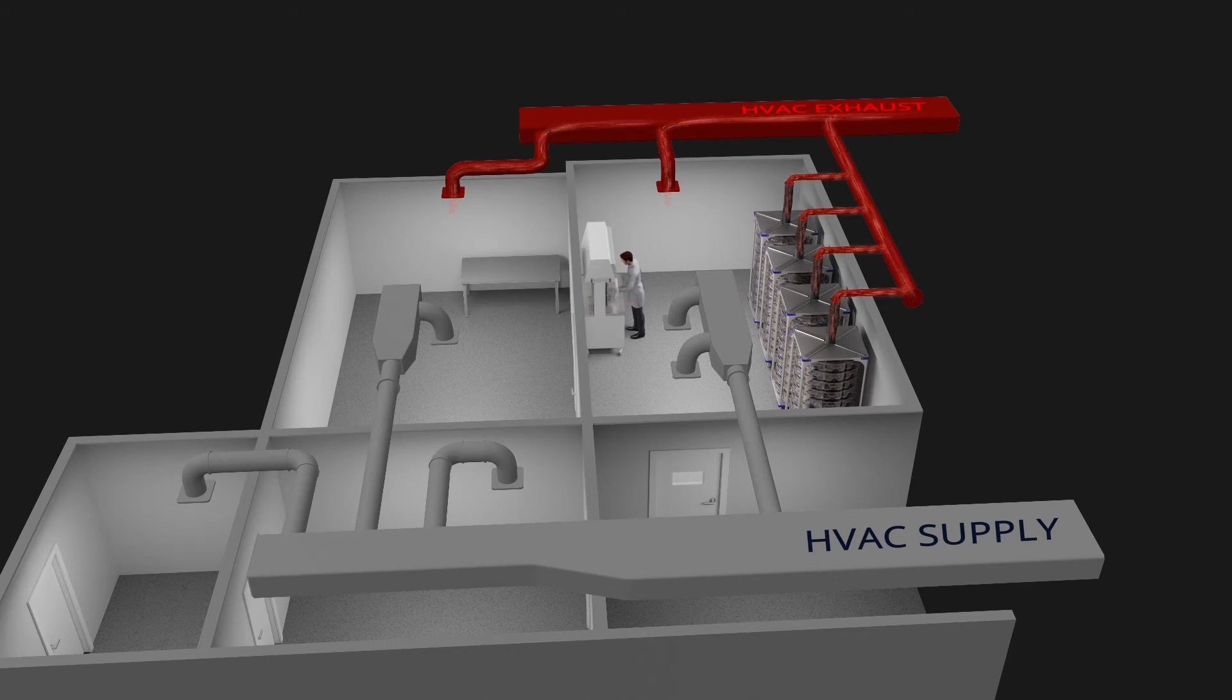With this integrated approach, Animal Care Systems utilizes the room's building exhaust system to both pull the air out of the room and also pull the air through the rack.